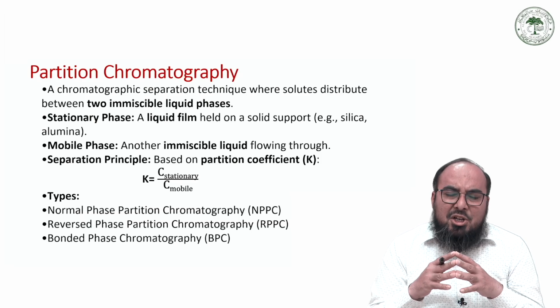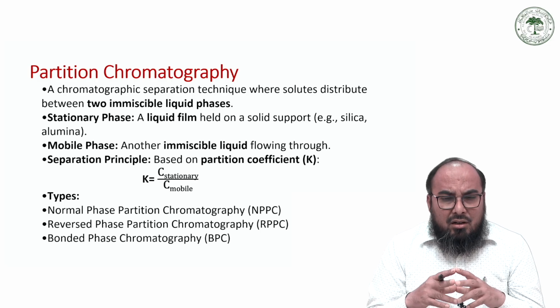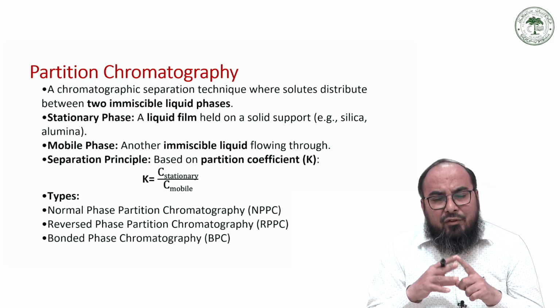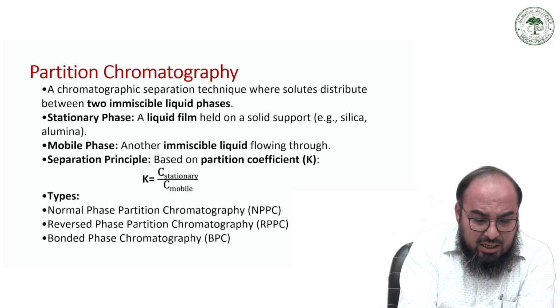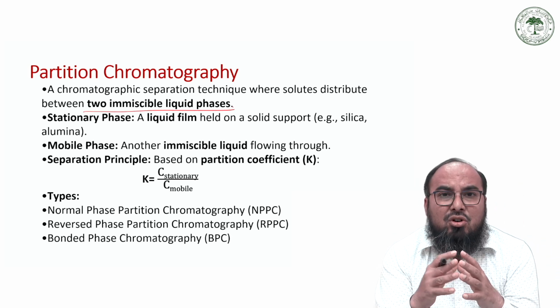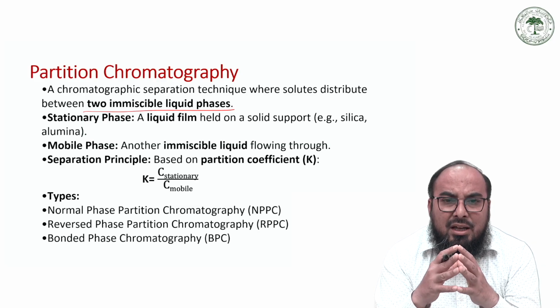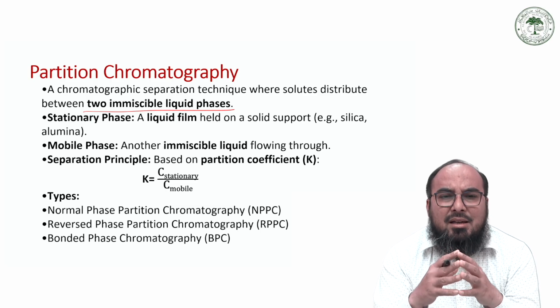Now, partition chromatography is a chromatography which involves two liquid phases, provided that those liquid phases must be immiscible, that is, they should not dissolve into each other, and the solute gets partitioned between these two phases, and thus separation occurs.